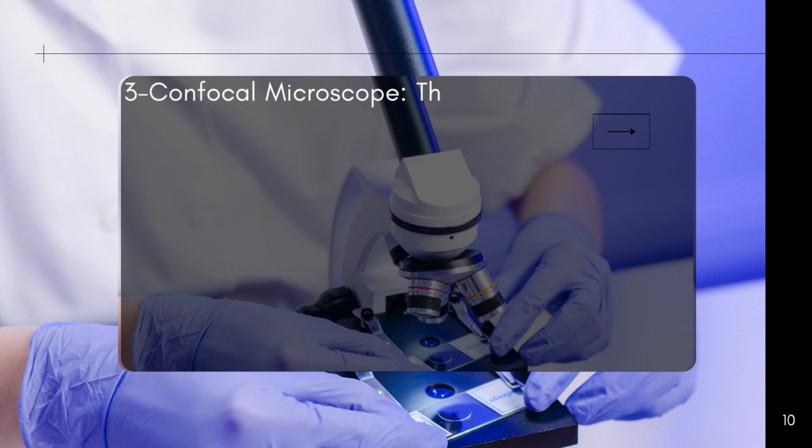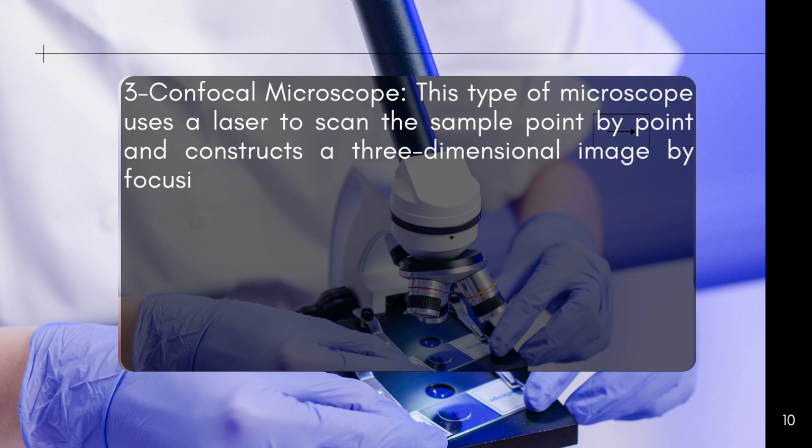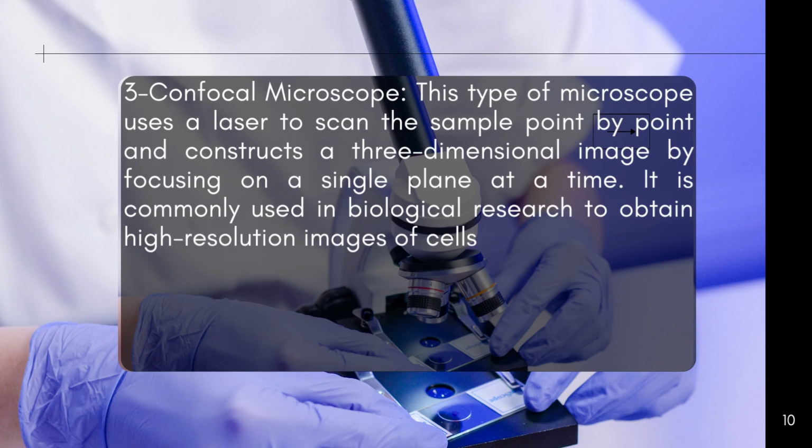Confocal microscope. This type of microscope uses a laser to scan the sample point by point and constructs a three-dimensional image by focusing on a single plane at a time. It is commonly used in biological research to obtain high-resolution images of cells and tissues.